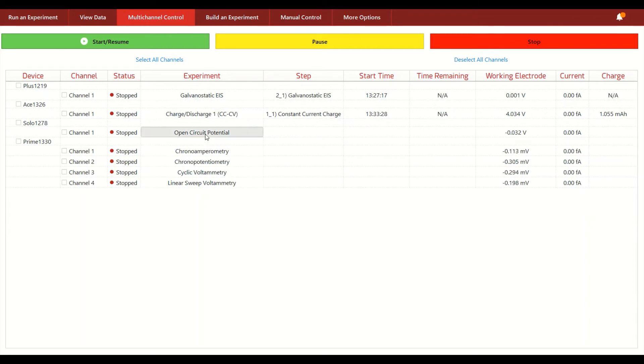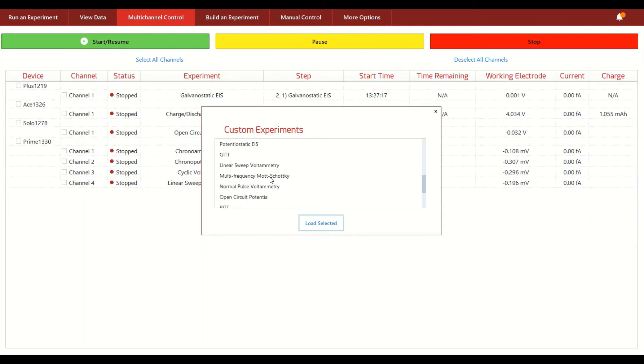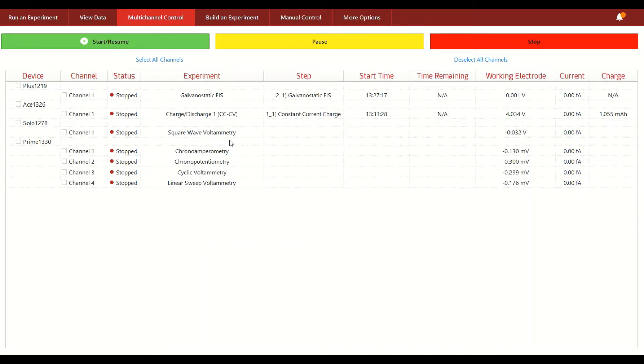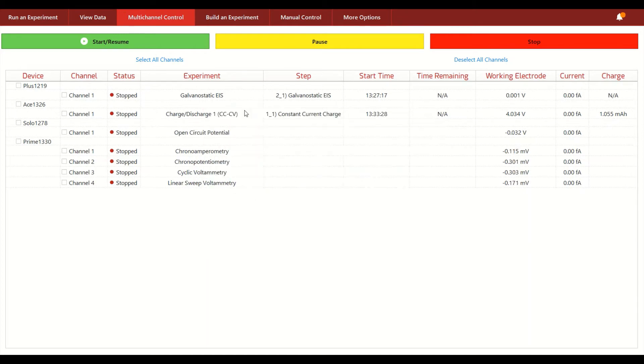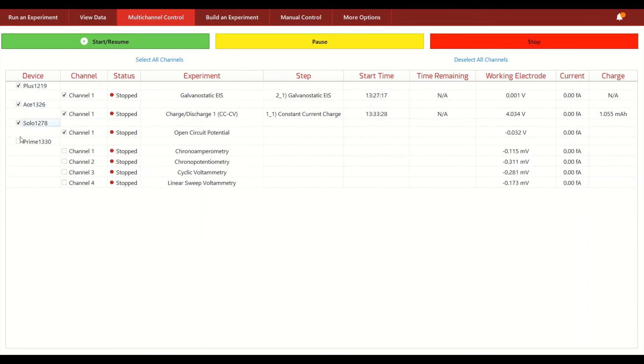However, it's just a matter of clicking on the experiment that has been selected if you want to pick a different sort of experiment to run. And so once you've selected which experiments you'd like to run on your different channels, you can either have them all selected to run these various experiments at the same time or you can mix and match which individual units you want to have run these channels at any given time.